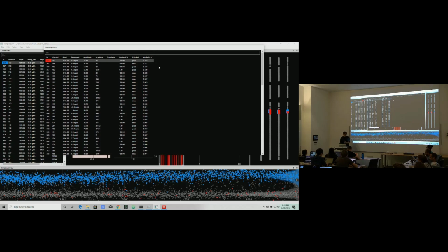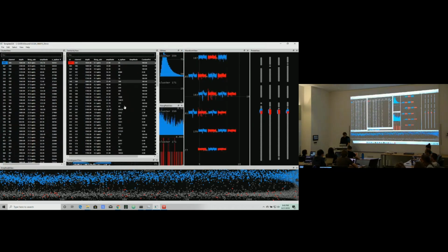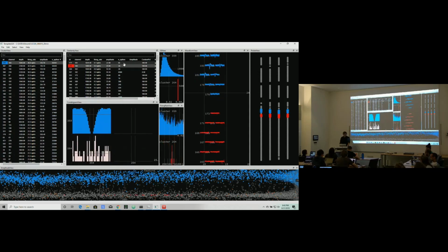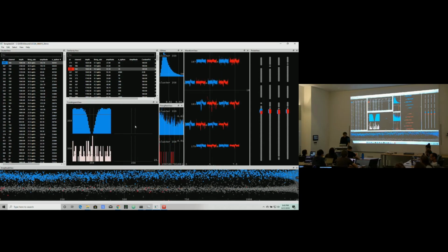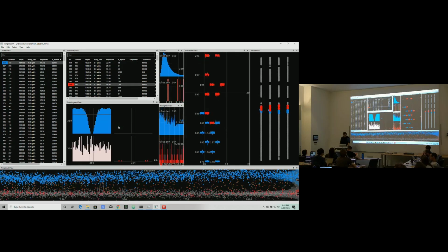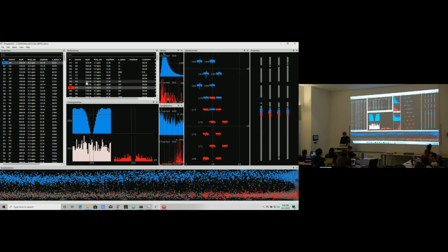We found a template that was well isolated from all these other guys, and we could just go through. If I press space again, it will go to the next one, but that's going to be even less similar to my original neuron, so there's no chance it's part of the same neuron. At least now we know this one cluster is very well separated from the other clusters. But there's still the possibility that this one cluster is a merge of multiple neurons.